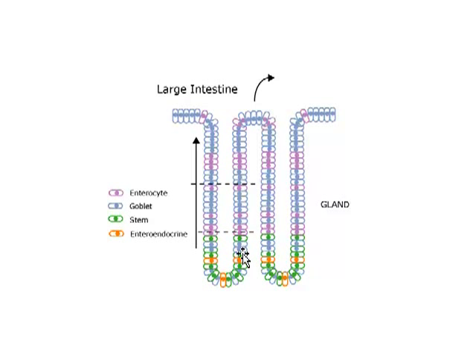As with the small intestine, division of the stem cells results in cells which largely migrate upward and can become either enterocytes or goblet cells. When they reach the surface, these cells are shed to the exterior. Between the glands is some connective tissue, but this isn't very apparent because the glands are so tightly packed. The key function in the large intestine is to absorb water and to secrete mucus, which helps lubricate the passage of the progressively more solid fecal material as it moves toward its storage site in the rectum.